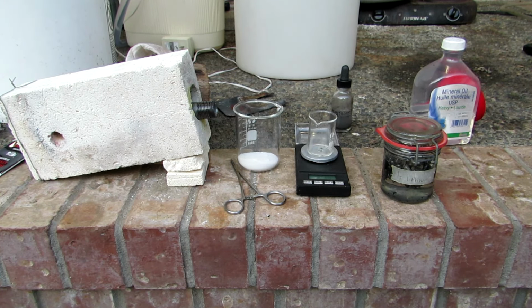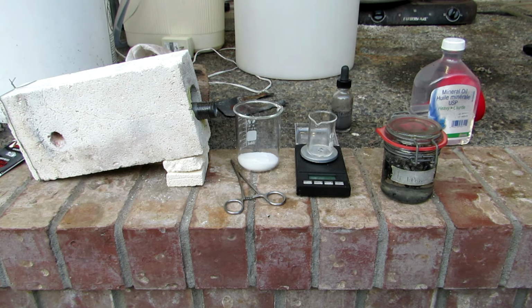Today we will be preparing some potassium metal through the reduction of potassium chloride using lithium. Potassium chloride is easily found as salt-free salt in grocery stores, and lithium metal can be removed from lithium batteries, which I show how to do in a previous project.